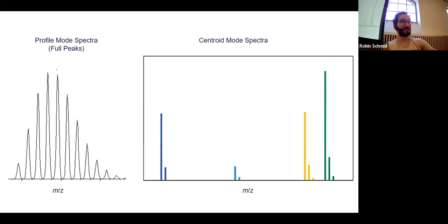So what we typically say is keep your raw data if you have it, and then also during the conversion, convert it to centroid mzML. That's the latest, at least open source format that most of the tools also use as an input. So for me, I always convert it directly after acquisition for Thermo raw data.